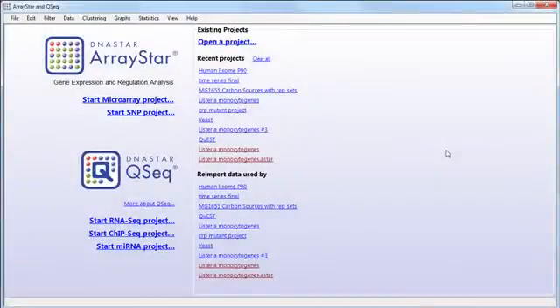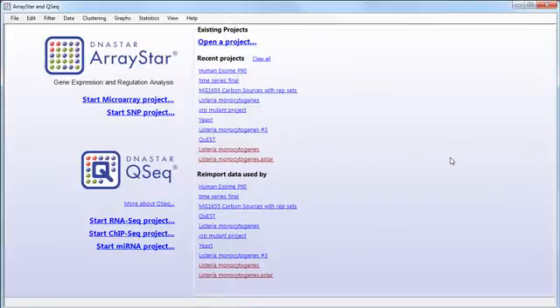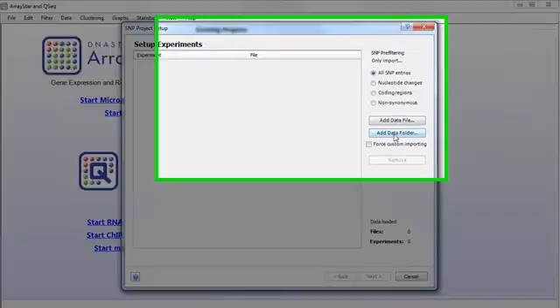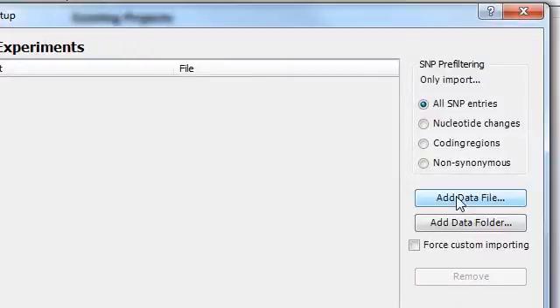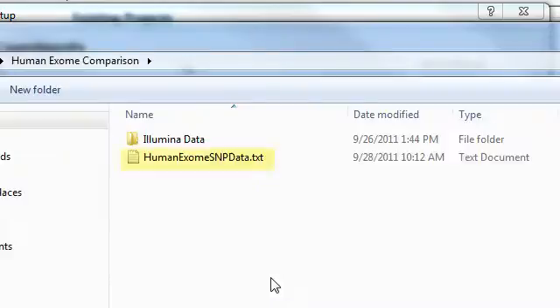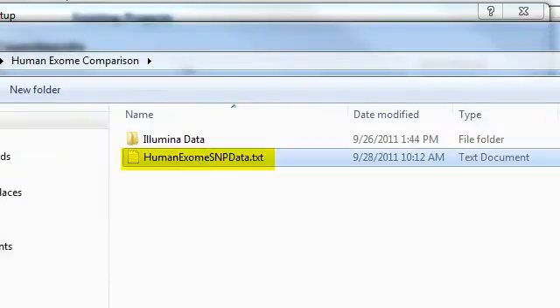Once the SNP report has been exported, we can open it in ArrayStar by selecting Start SNP Project, then clicking on Add Data File, and selecting the text file that we just exported.